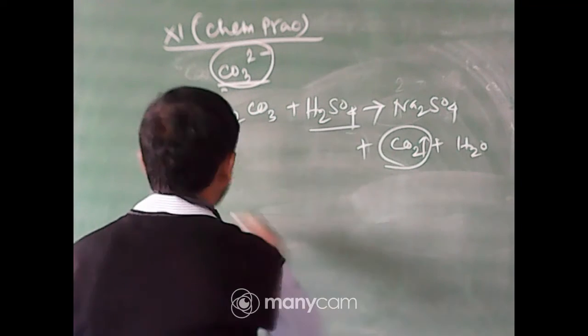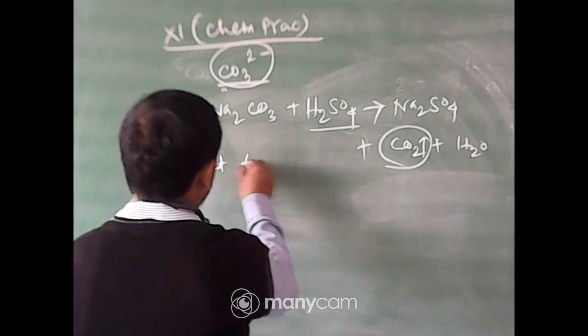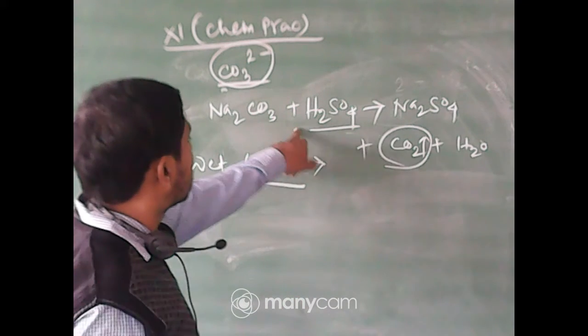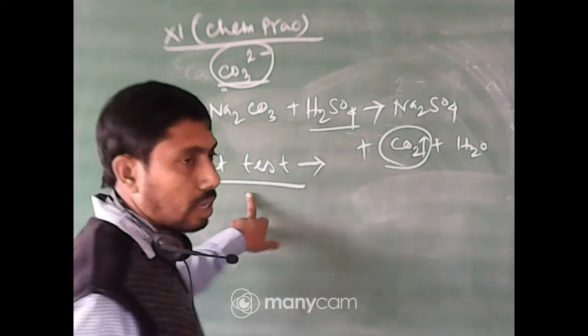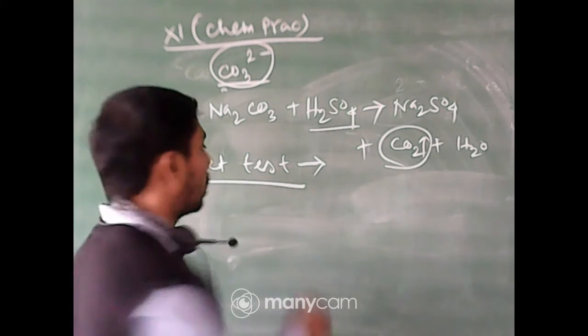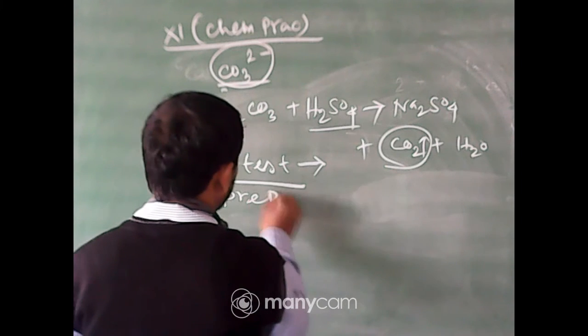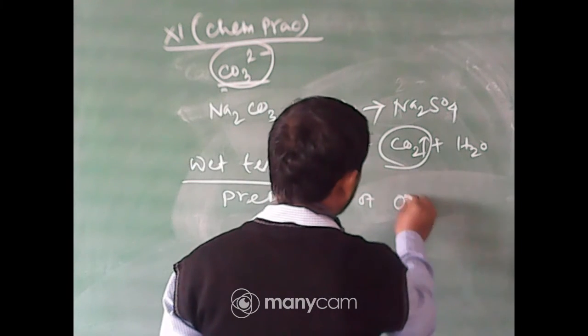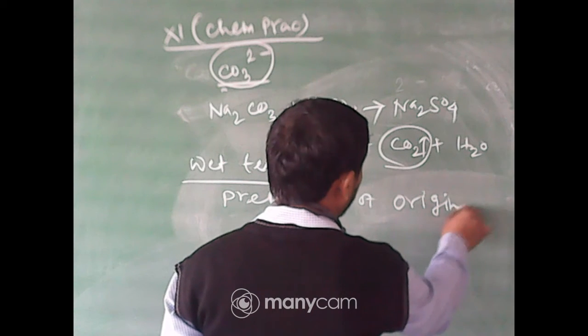Now this is another kind of test, that is the wet test. This is the dry test, this is the wet test. Now for the wet test, what we have to do, first, is to make the solution. So, preparation of the original solution, or OS.